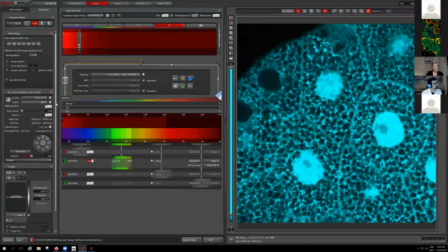But before that, let's talk a little bit more about how we are designing the experiments. When you have the FLIM module activated, you see the FLIM window. There are some possibilities here for how you can apply that to your FLIM measurements. Usually I use the frame repetitions, depending on the sample, the acquisition, the brightness, and what I would like to measure. That can be something between 1 and whatever is required, but not really so long, because at some point it doesn't make sense. Also down here, what is important is the frame size and the speed.